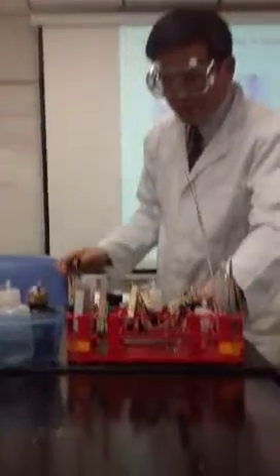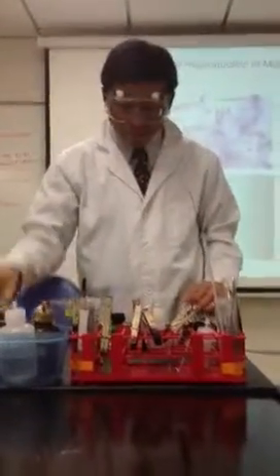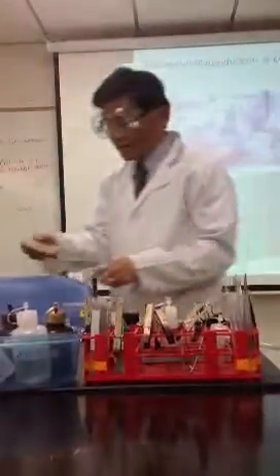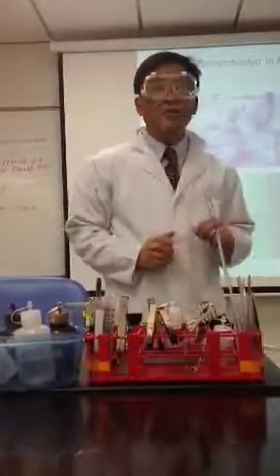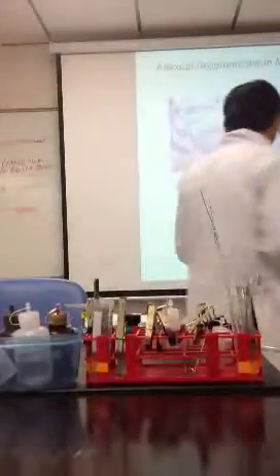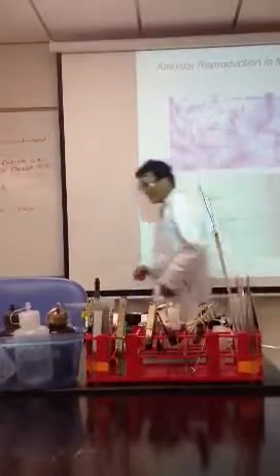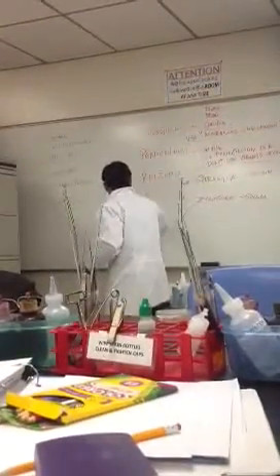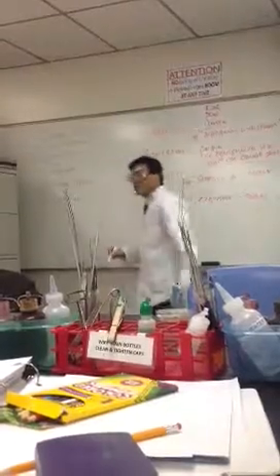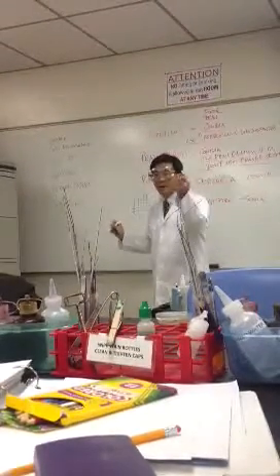Okay, all right, so now, what you do, for some of them, like the back two, you notice that your plate is divided in little squares. So you have these nice little jello squares to work with. You take one of these little squares.